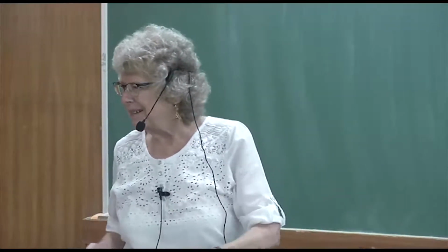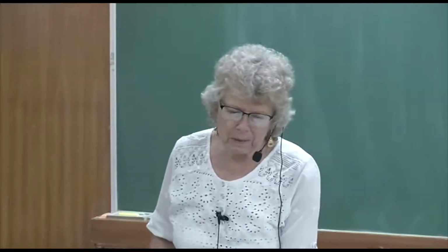Now, George Sheldrick was writing this software in the days of Fortran, so in some ways you might find it a little primitive, but actually I think he's a brilliant man, and I think what he's done for the community is just incredible. Because before he came around, there were different programs from different institutions, you know, Caltech, Brookhaven, you name it. And each one was a separate program. And of course, in those days, we were using IBM cards. So it was really a relief to have somebody come along and put all of this together. And as time has passed, he's kept on changing his programs and making them more and more modern and more efficient and faster. So anyway, we will see.